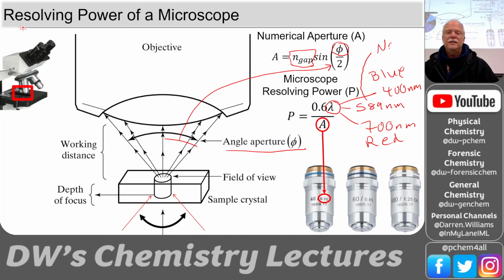Sodium. Okay, sodium lamp. It's a very inexpensive lamp, and it's that yellow light you sometimes see on street lights, the yellow street lights, the sodium vapor lamp. Just like we have mercury vapor lamps in all of our fluorescent tubes and so on, the sodium's even cheaper than that. And so they have sodium lamps. So that 589 is a good number to use. It's right in the middle of the visible range.